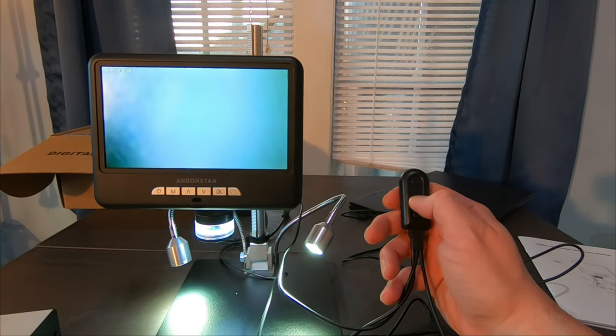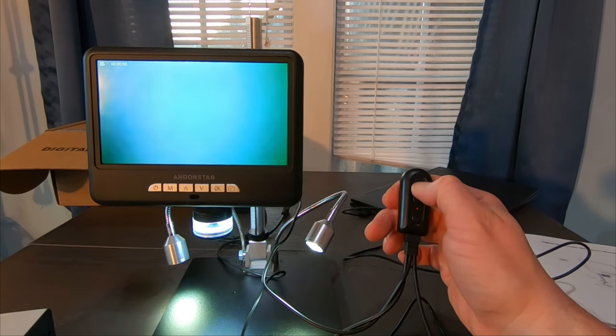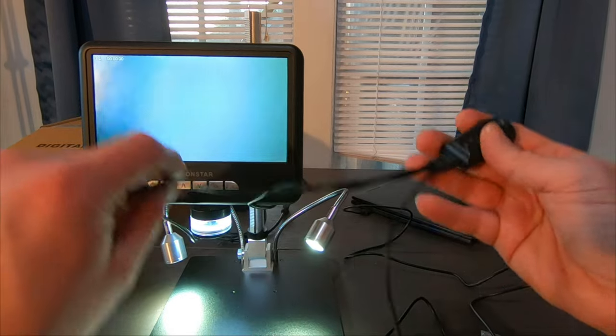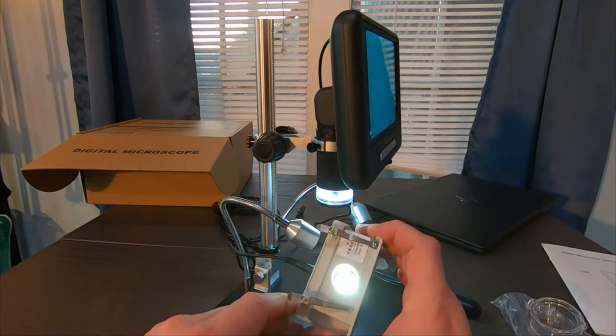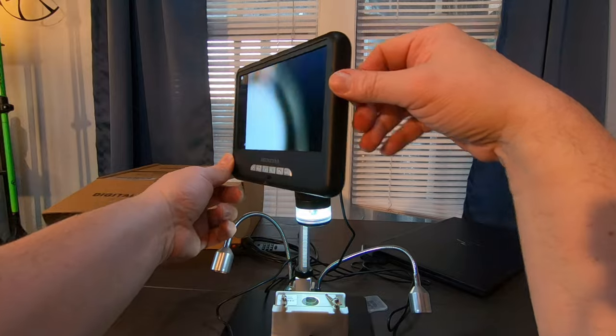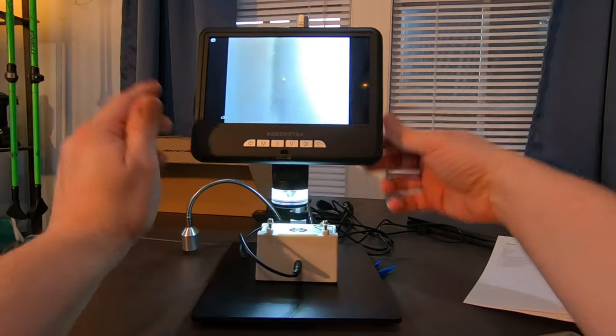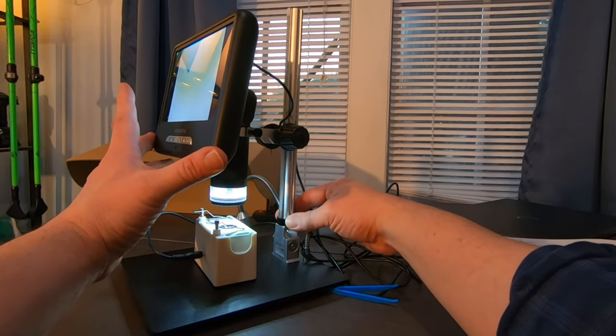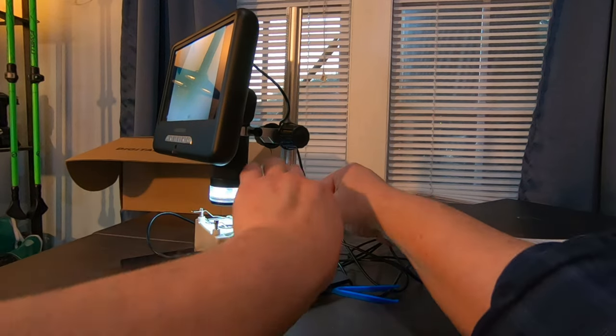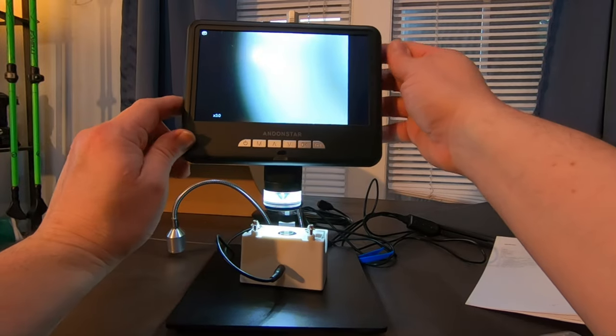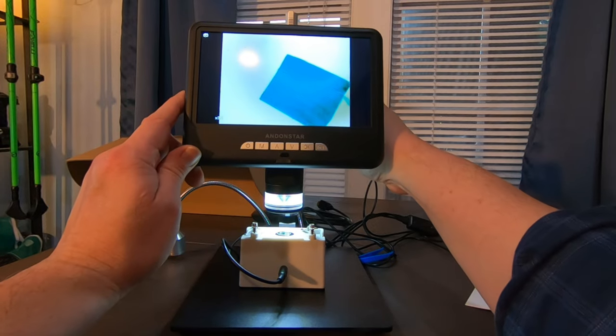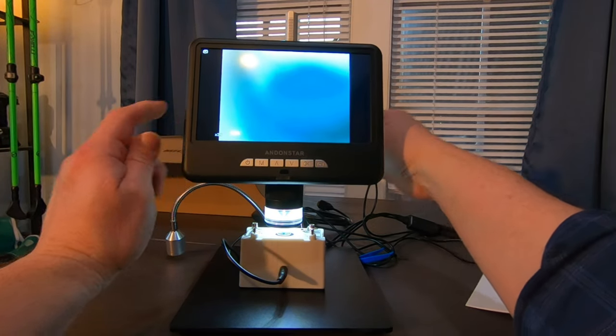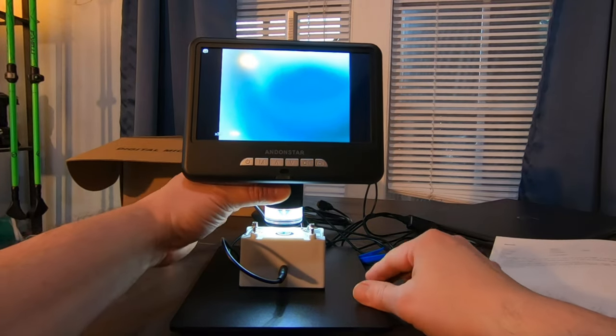It looks like I can, with the remote control, make it brighter or not so bright. See, turn down the brightness. Increase brightness. So that's kind of nice. We'll have a little remote control there. And watch this. Light comes on. I don't even see the light. There's the light. Notice this moves either right or left, up or down. Okay, now notice how this is moving a lot. To keep that from happening, what I'm going to do, this ring down here, I'm going to tighten this ring here. And now it's locked into place. Tight. There. And now that's locked. And that's not going anywhere. And now I can put my image right there back. And I can zoom in closer. So let's go closer there. And now let's adjust the sharpness. Sharpness.